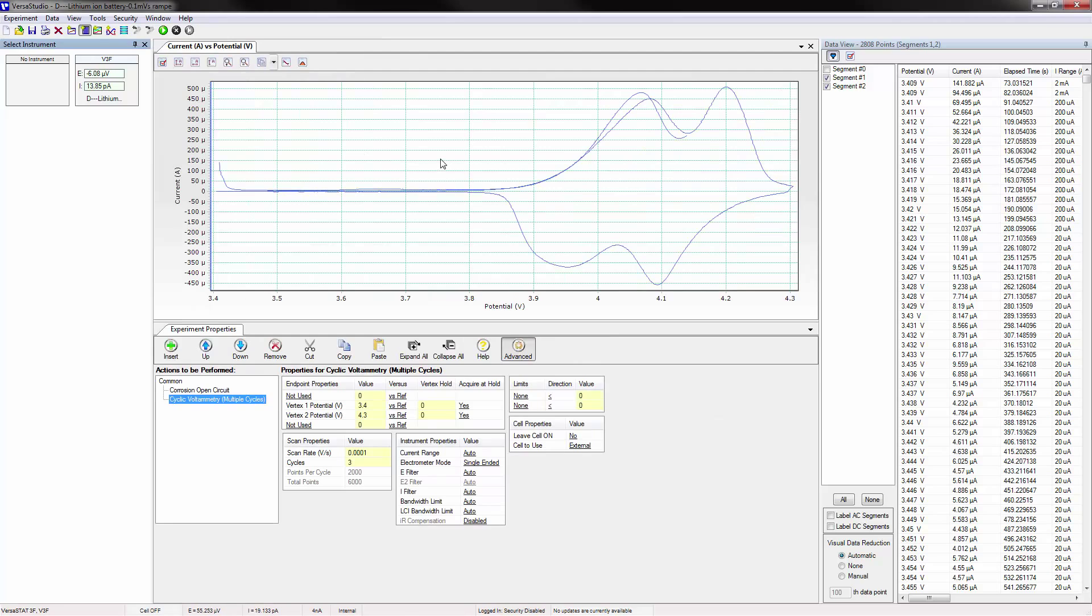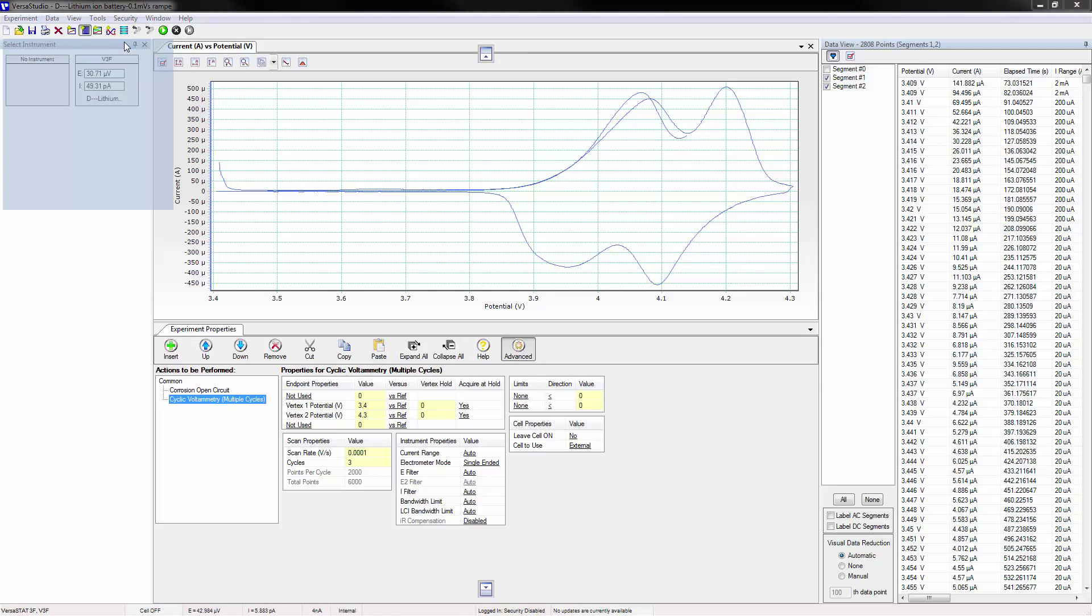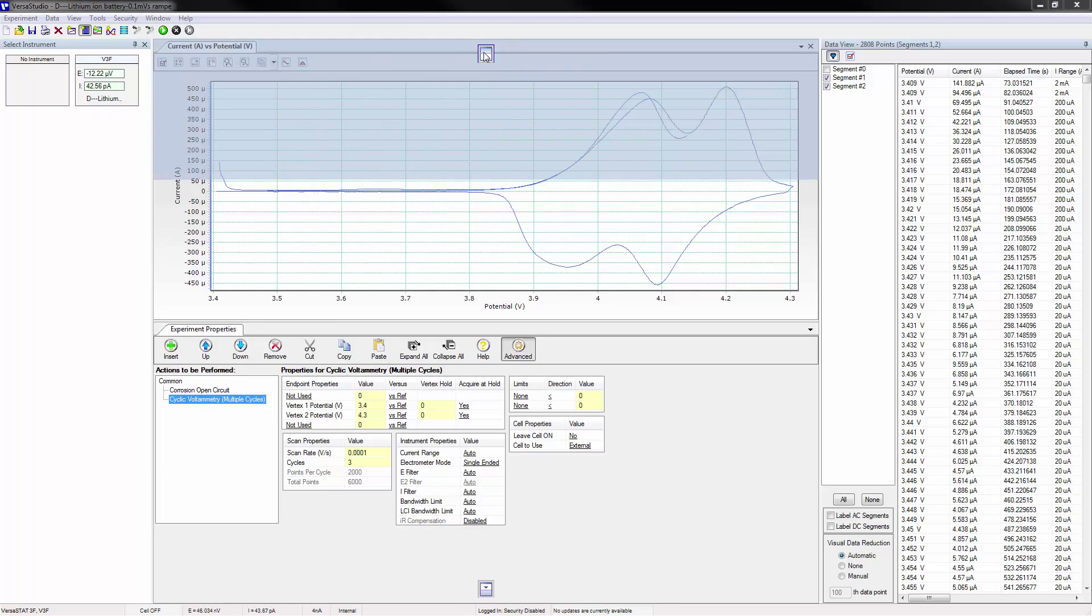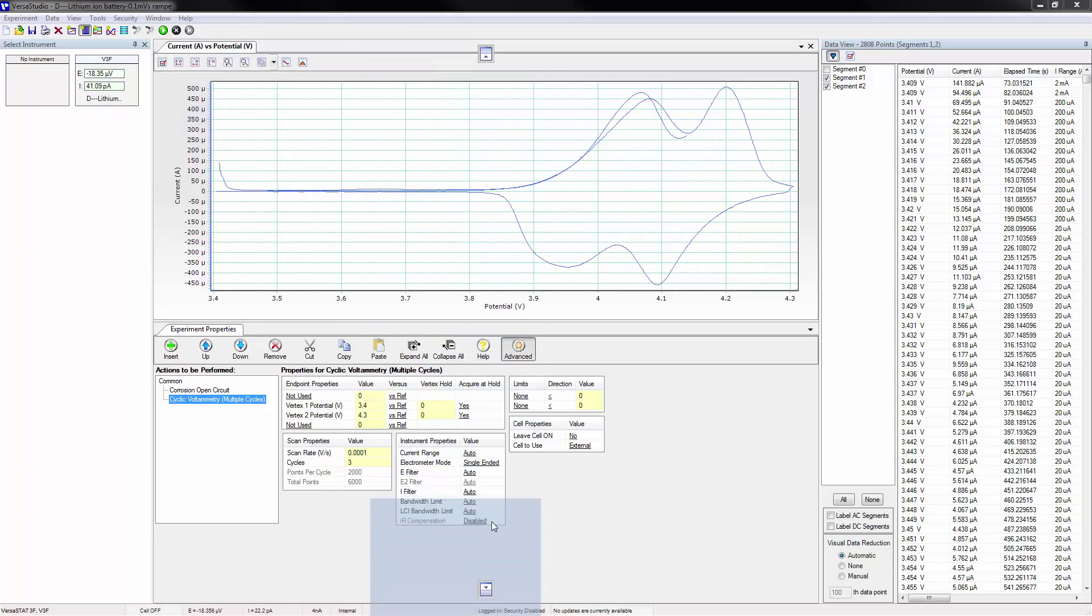Like the graph, experiment properties, and overlay manager windows, the select instrument window can be moved by left-clicking and dragging the mouse until the various options appear. It can then be placed at the top, at the bottom.